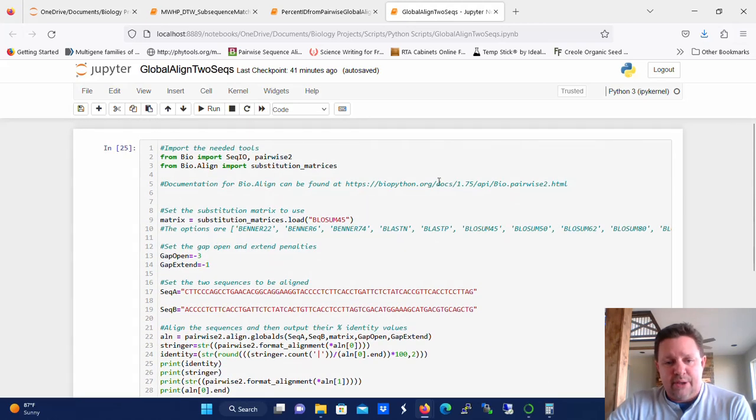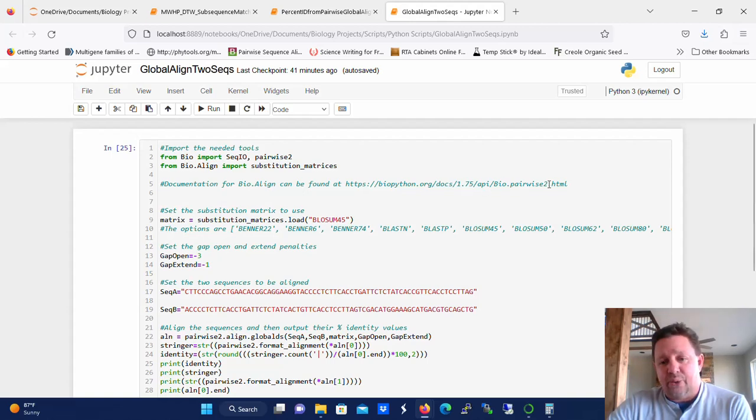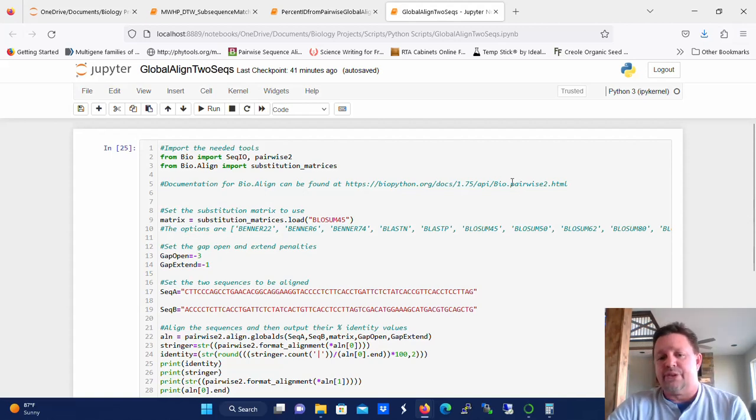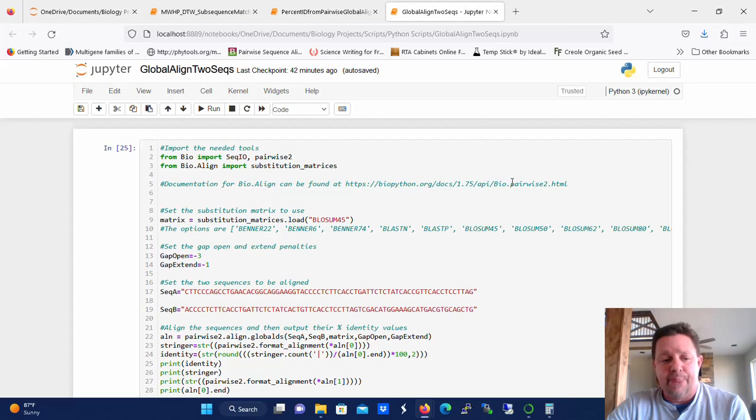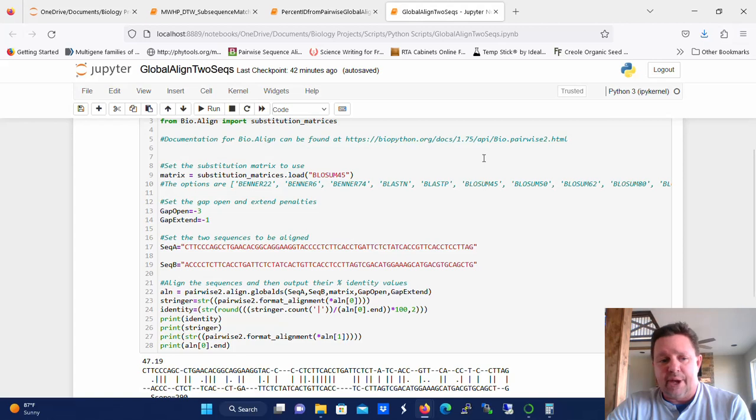So in the top of this script here, I included the link to the alignment, bio.align, to where the documentation for a pairwise alignment, so when you're aligning two separate sequences. You're not doing a multiple alignment here, you're doing a global pairwise alignment. So you're aligning just two sequences at a time. That's where you can find the documentation. If you run into any problems, refer to that.